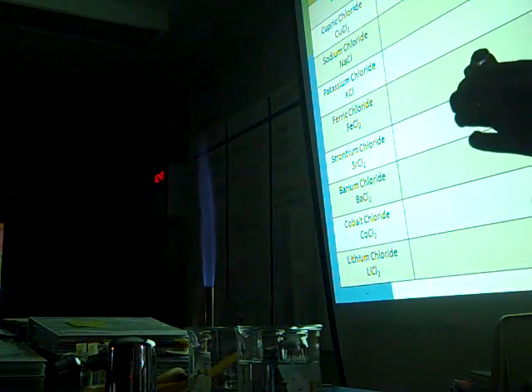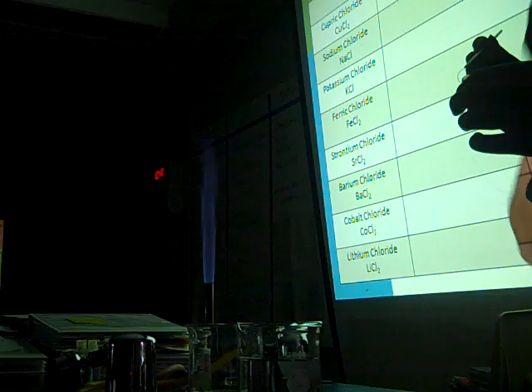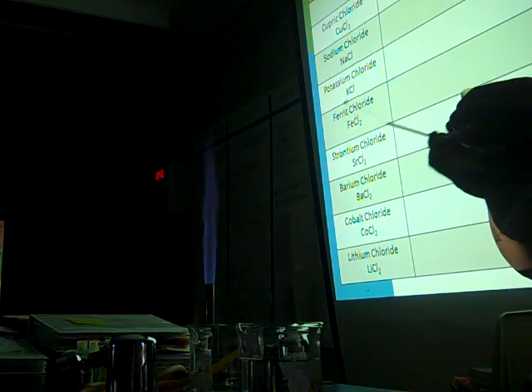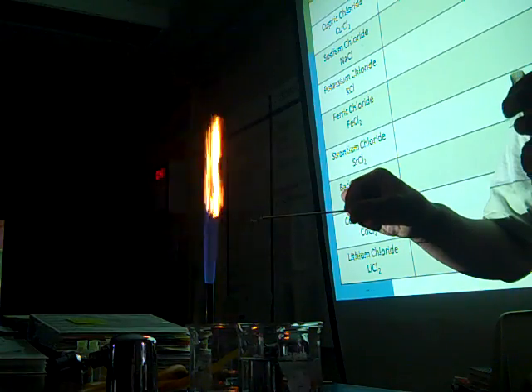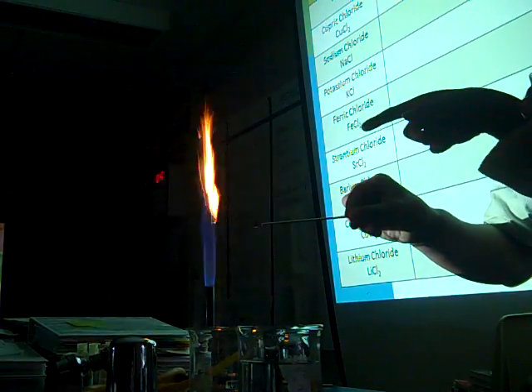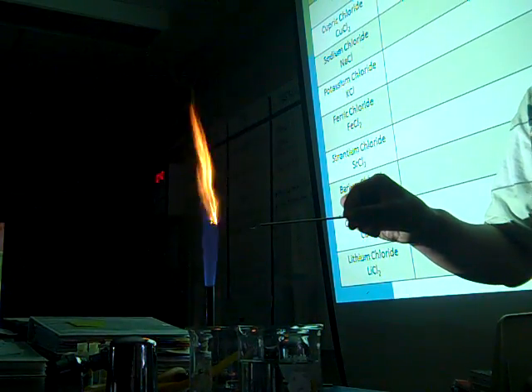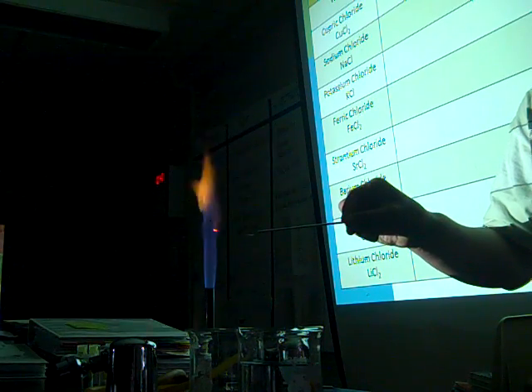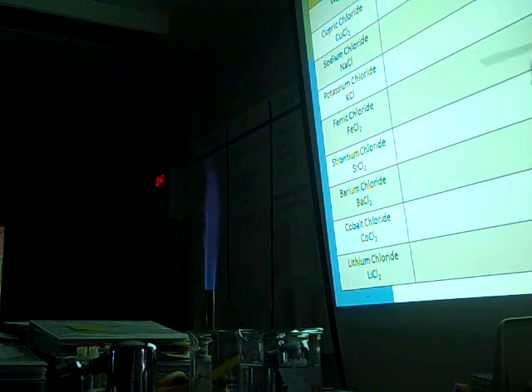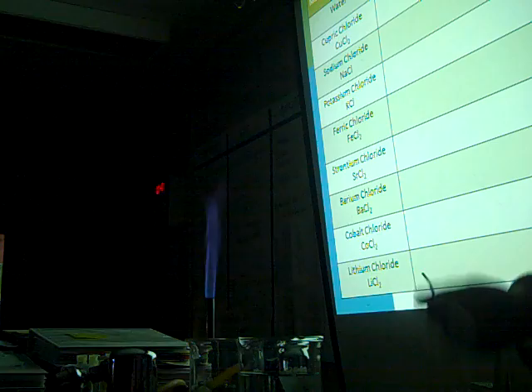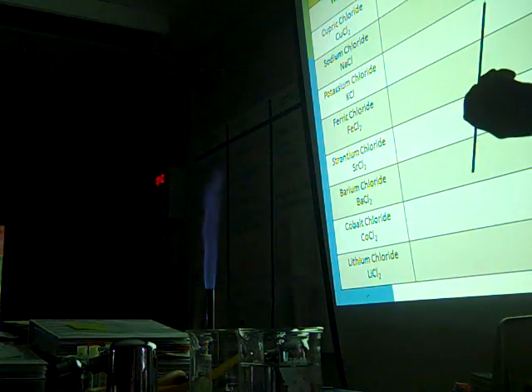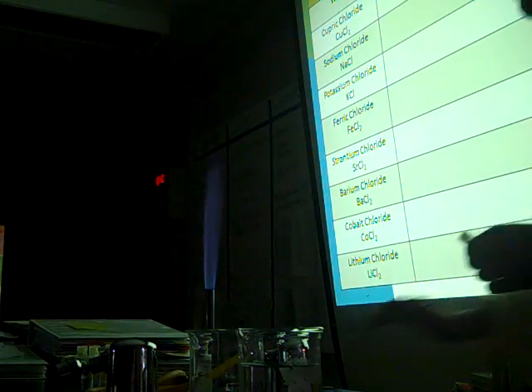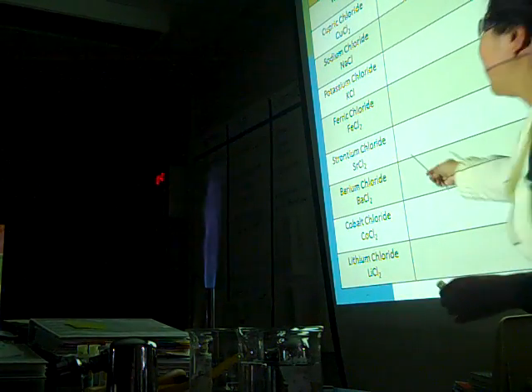All right. Oh, no, wait. You can do the second one, Siope, if you want. Yup. All right. So ferric chloride. Did you see it go green first? Oh, what do you see? Right there. Right there. What's going on right there? It's sparkly. It's sparkly. It's sparking. Yeah. Awesome. Cool, thank you. See how big. That's huge. I think I just charred it on there. All right. All right. So that was ferric chloride.